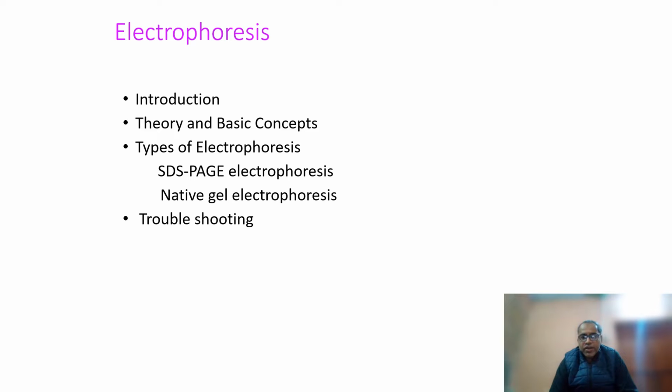Then we will see what kinds of electrophoresis we have, for example, horizontal gel electrophoresis, agarose gel electrophoresis, which we have been using for DNA, which is a routine lab technique for quantification of DNA, as well as studying, for example, restriction digestions, and quantifying genomic DNA as well. Analysis of DNA, whether it is intact or has been degraded.